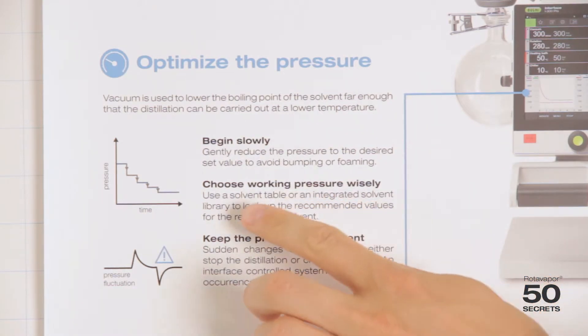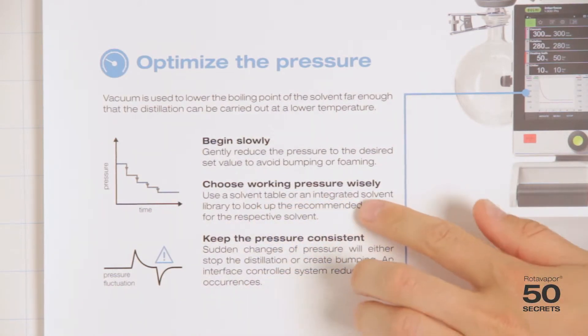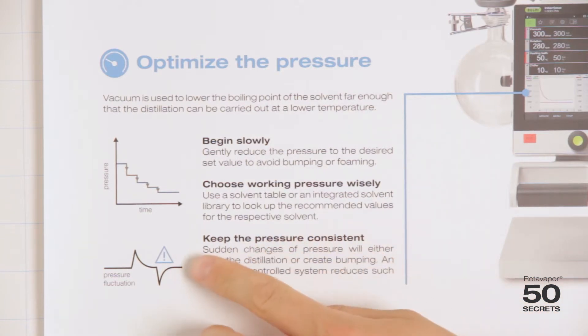The second topic is choose the working pressure wisely. Usually you just use a solvent list or a solvent table to find the right vacuum. And the third one is to keep the pressure consistent.